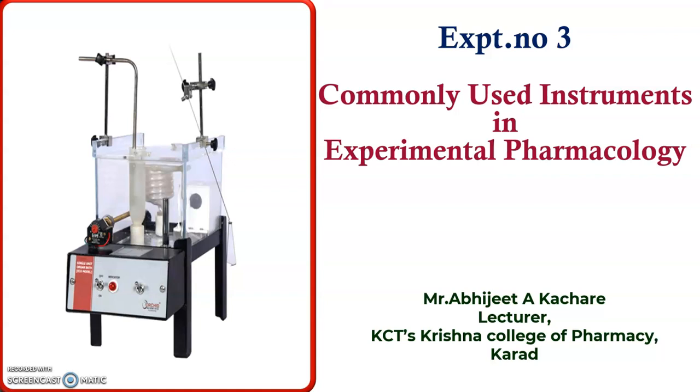Let us discuss the new experiment under the subject Pharmacology Practical. Experiment number 3, commonly used instruments in experimental pharmacology.